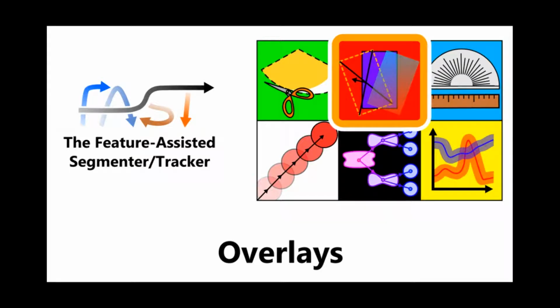Hello and welcome to this part of the FAST tutorial series. In today's video we'll be looking at how to use overlays to provide information-rich visualizations of our datasets.